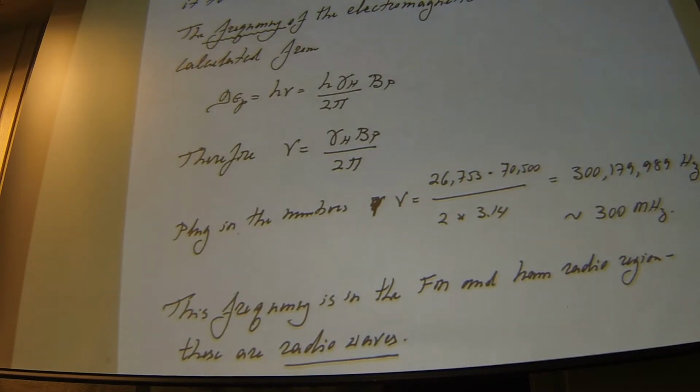I measure spectra for the same compound that you measure using a really weak magnet. Now we want to compare our results. And if we report them in hertz, then, hey, guess what? We're going to have different results because you're going to measure a smaller number of hertz because you have a weaker magnet, and I have a stronger magnet. I'm going to measure a larger number of hertz, and we can't talk to each other.